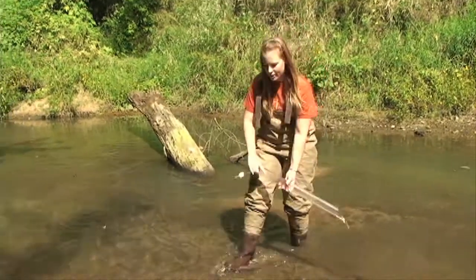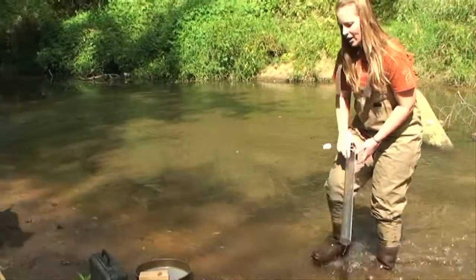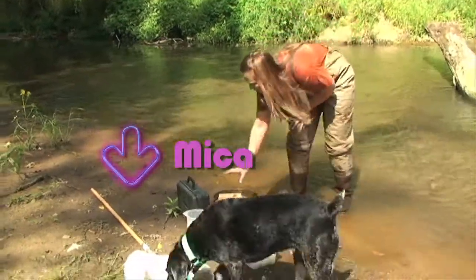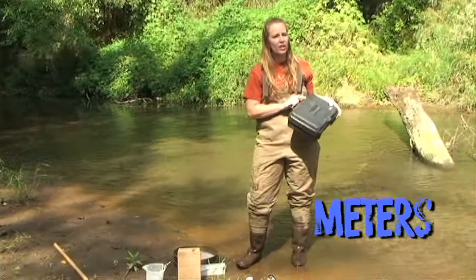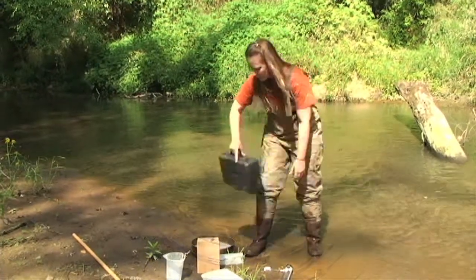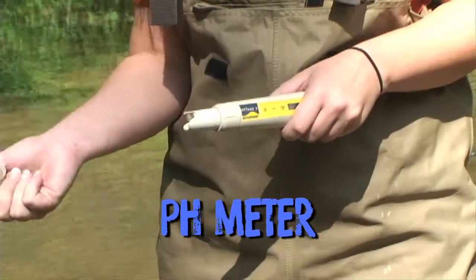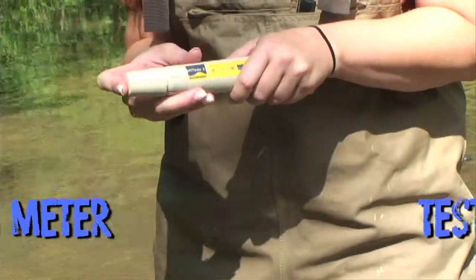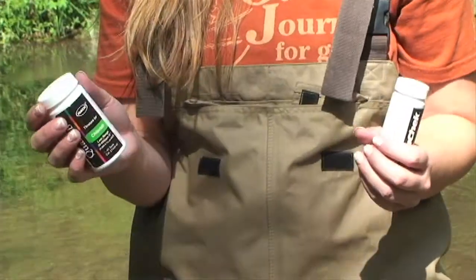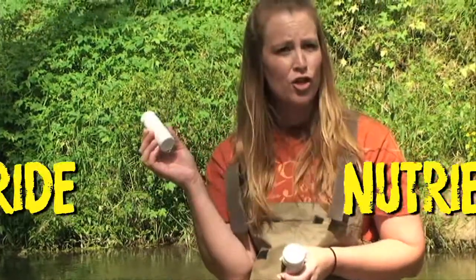Besides the transparency tube, we have a lot of other equipment that we can use to look at what kind of things are in the water. We have meters and they can look and see how much oxygen is in the water, the temperature, the pH. This is a pH meter that we can use. We can also use test strips to test and see what kind of chemicals — so this is for chloride and this is for nutrients.